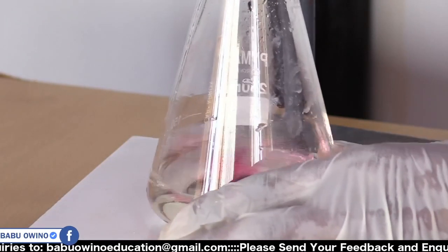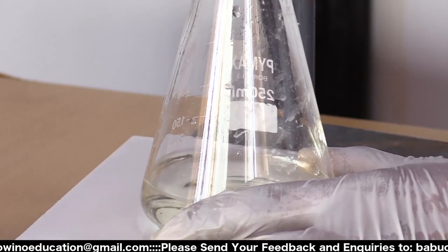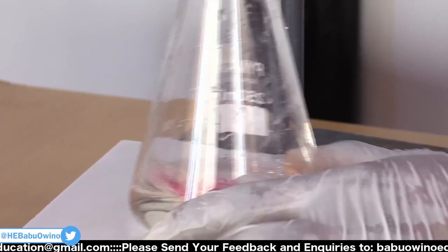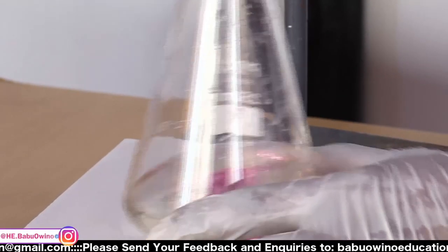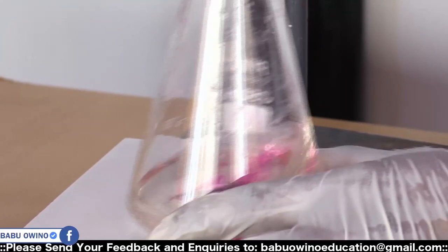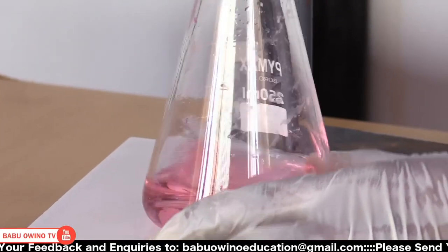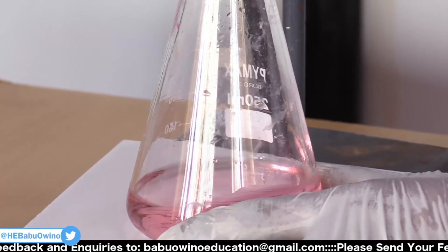When it gets closer, you can see from the first one, the second one, you can't go outside 36. So you will be within 36. So if you can now run it all the way up to around 36 there, you will be home and dry. Then you run it drop by drop.